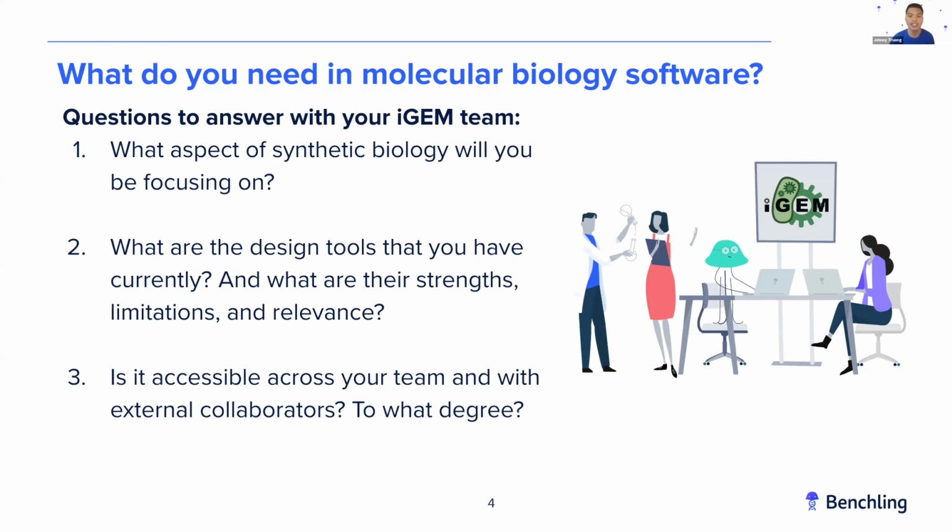Second, think about the design tools you're already using. What are some of the pros and cons that you've seen and that you've observed? And additionally, is it going to be relevant to your iGEM project now, or is it something that you learned how to use through courses or through other opportunities?